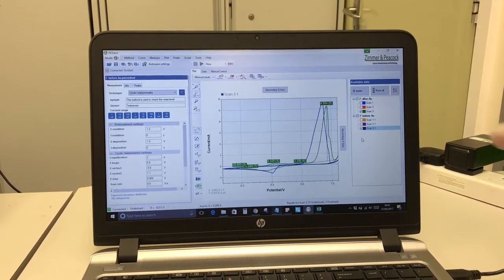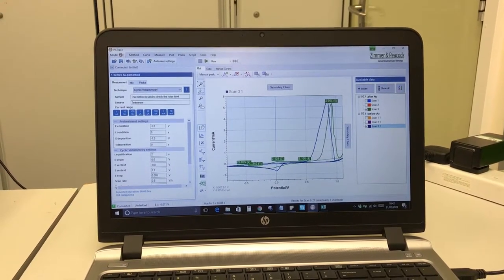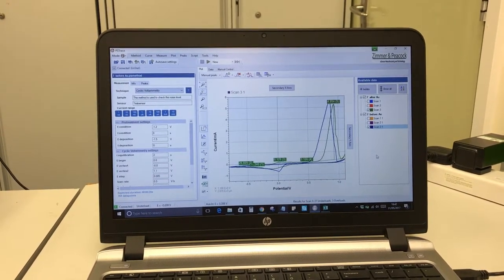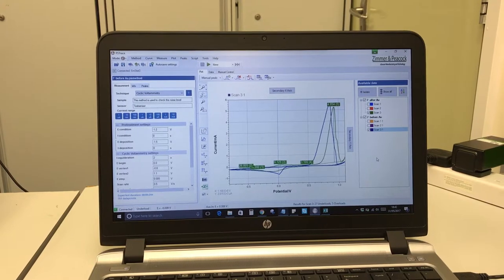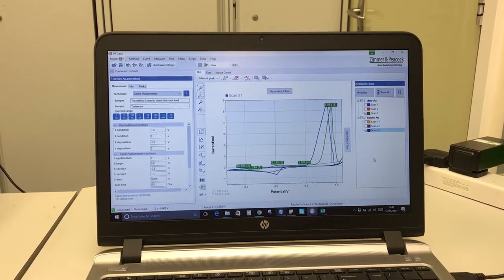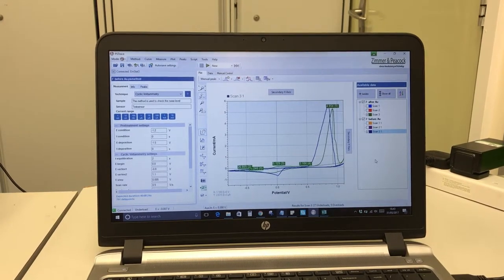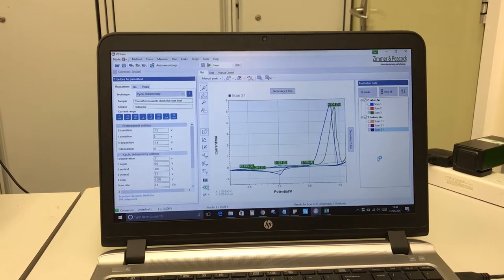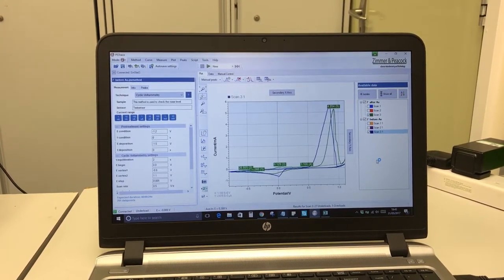So as you can see on the screen, we can see the difference. So we have increased the binding surface and also increased the density surface of our sensor. This kind of application has already been used for different detection, for example, using gold nanoparticles and thiolated aptamer, as I mentioned before.